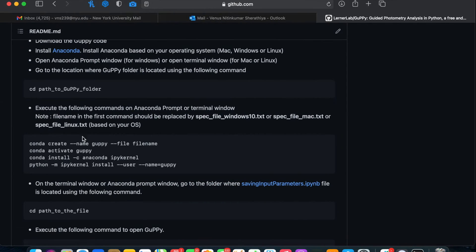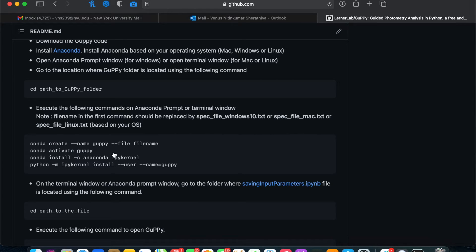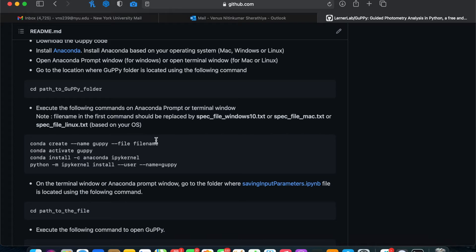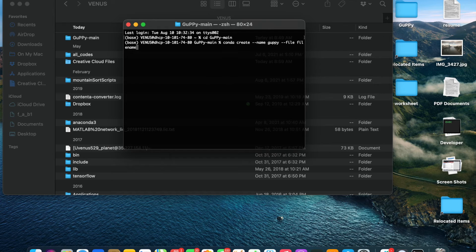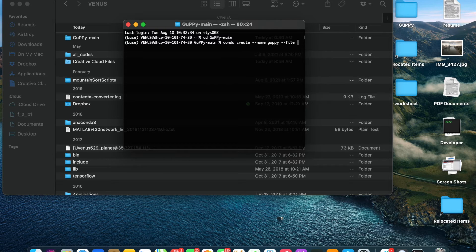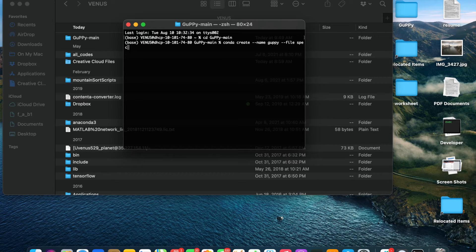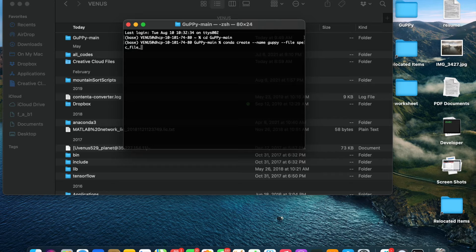Next, again, if this is your first time using, you'll need to install some packages in order to be able to run Guppy. So we're going to create an environment using a file that's in the downloaded folder. Copy the first line into your terminal or Anaconda prompt window, changing the file name to the appropriate file name for the type of system you're using.